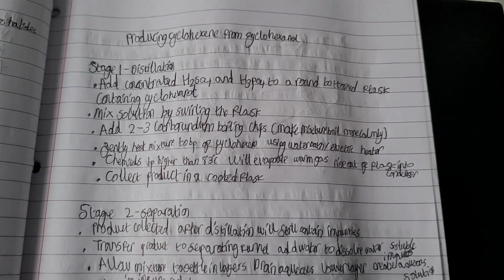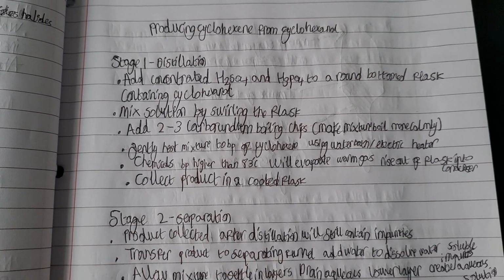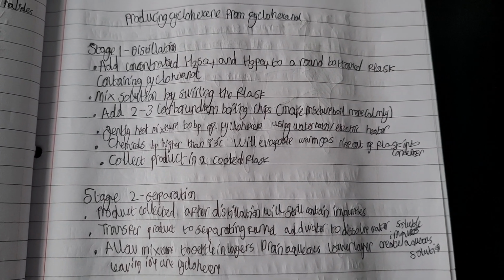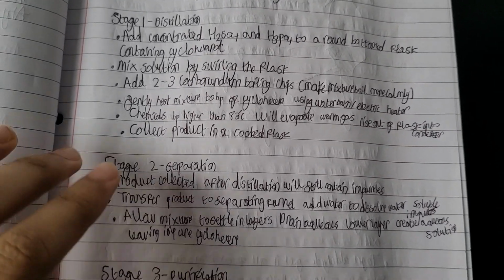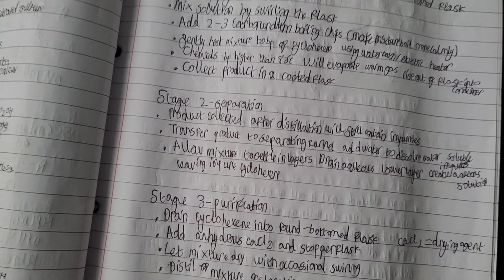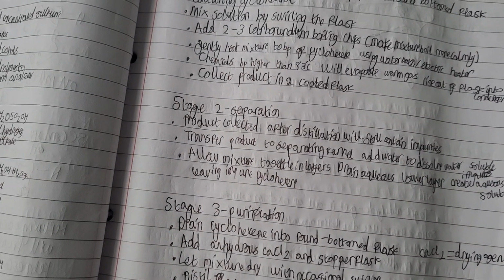So, practicals. Producing cyclohexene from cyclohexanol. Stage 1, and before I go through this, this practical is probably one of the hardest in year 1. So don't be overwhelmed with the amount of content I'm going to go through just for this one practical. Just remember, you can go through it once a week and you'll eventually know it all off by heart.